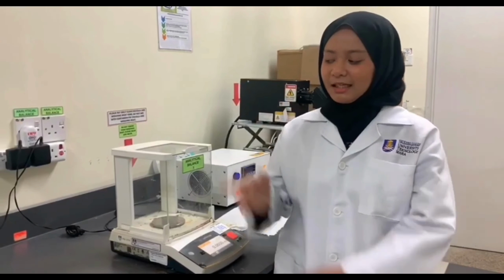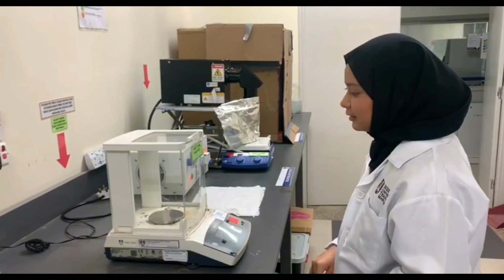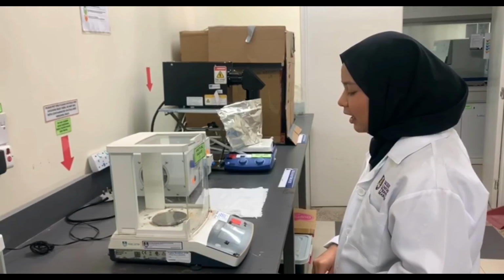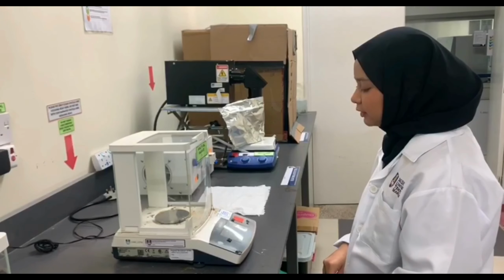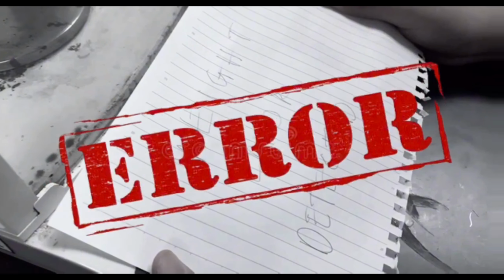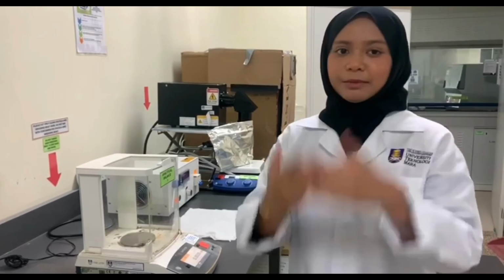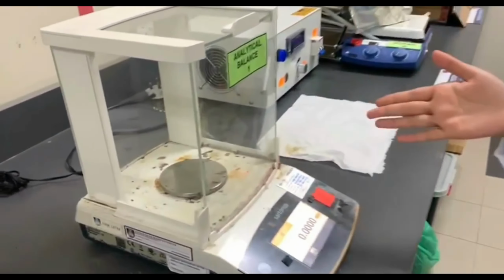Welcome to the lab, where one tiny mistake can turn your paracetamol into poison. No pressure. First up, the analytical balance. This machine is so sensitive, it basically has trust issues. Like, you just look at it too hard and the number changes. I swear, if I breathe too close, it's like weight error detected. So I stand still, hold my breath and pray to the science god that I get the exact weight, because if I'm even 0.01 gram off, boom!